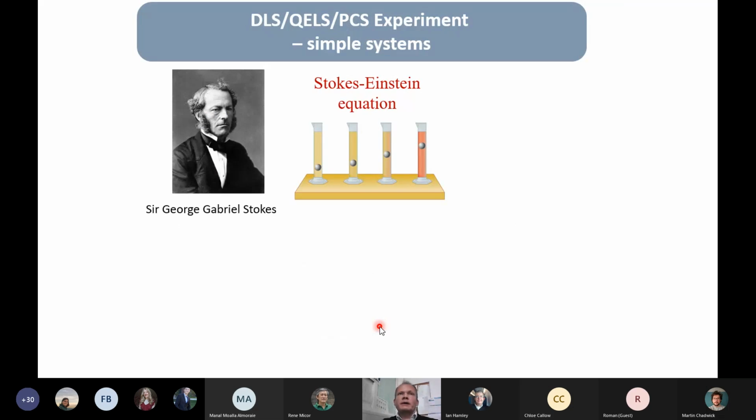Right. Now, I hope I convinced you that using dynamic light scattering from a solution of monodisperse, non-interacting, dilute food proteins, we can get the experimental value of the diffusion coefficient. But we definitely would like to know something else, right? Probably the size of our species, what kind of object we're dealing with.